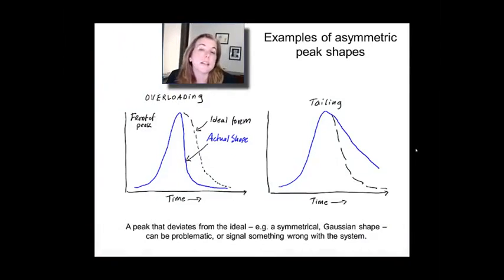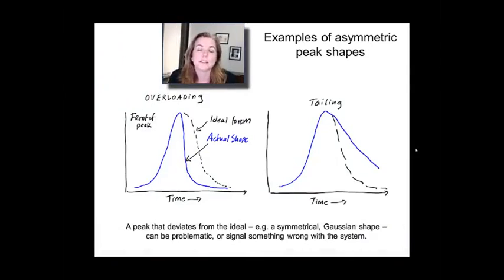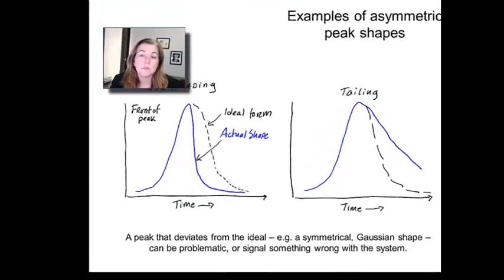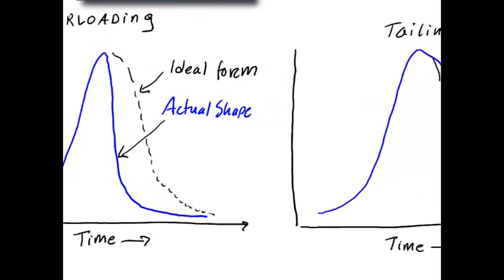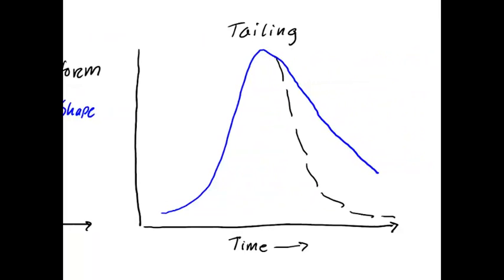So here's a couple of examples of the kinds of peak shapes that you actually may see in practice. Sometimes you'll get something called overloading, as I'll describe in a second, in which your peak basically looks like you're missing everything that comes at long times. Or sometimes you get tailing, which is you get this very long tail to very long times.